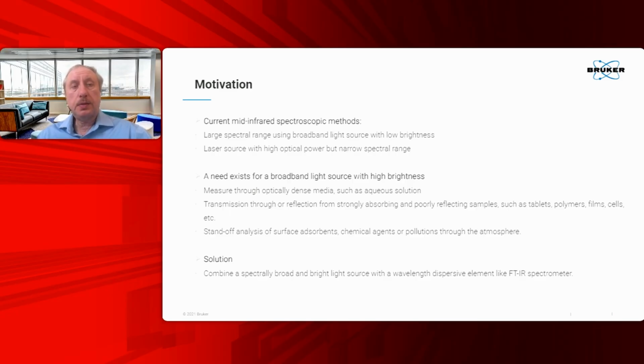What kind of needs exist for applications in the FTIR world and all of vibrational spectroscopy? We need a broadband source with high brightness. One of the reasons we need it is if you would like to measure through optically dense media, for example an aqueous solution, where water absorbs a lot of infrared.